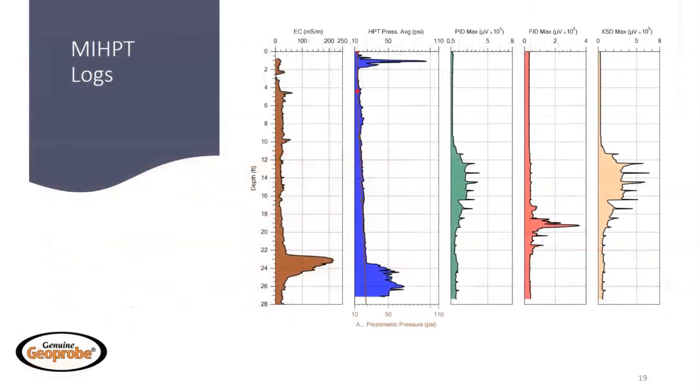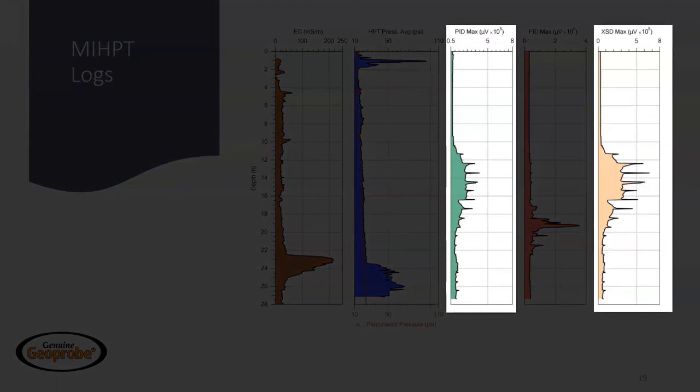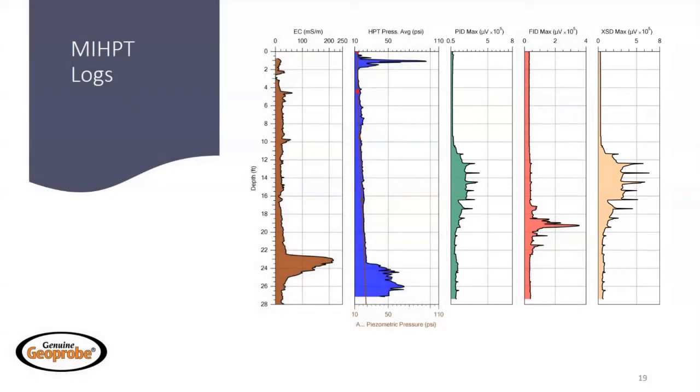Now let's interpret some logs. Here we have a similar patterned response on the PID and XSD. Since the XSD is responding, we know it must be halogenated, and with the PID providing a similar pattern, it must be double bonded, and its ionization potential must be below the excitation of the lamp. We likely have a PCE or daughter product plume.